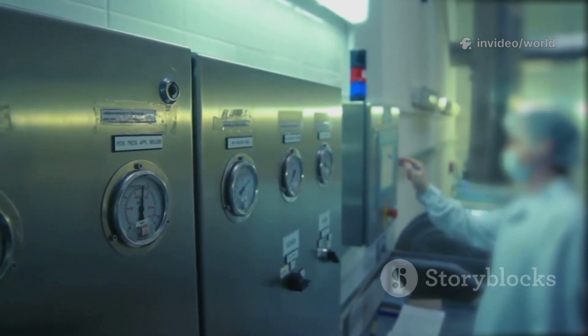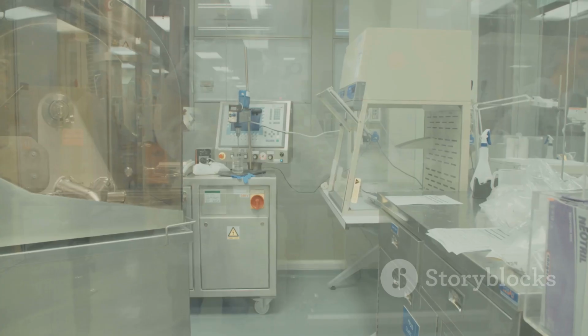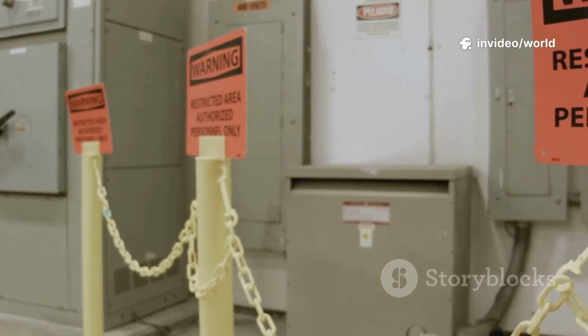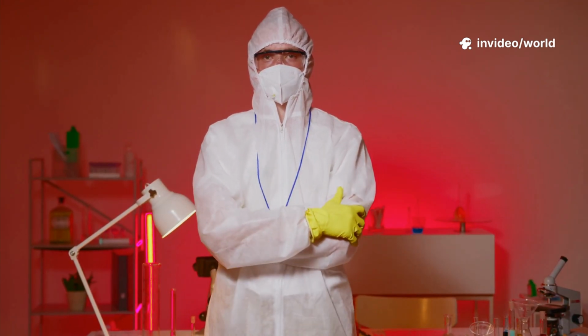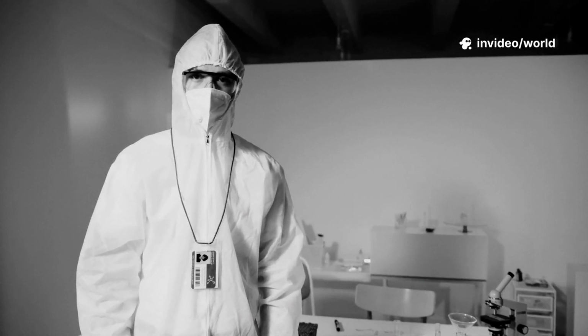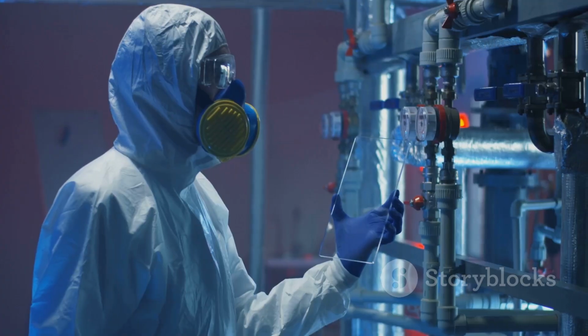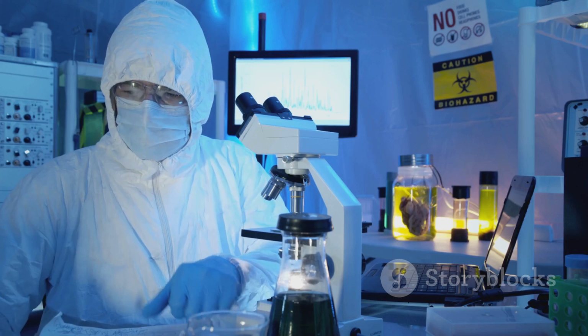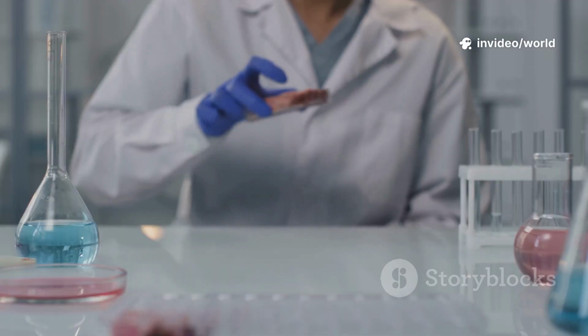We're talking negative pressure to keep the bugs in, HEPA filters to scrub the air, and access so tight you need clearance just to step inside. And PPE? It's non-negotiable. I suit up with an N95 mask or a PAPR, a Tyvek suit, and double gloves every single time. All my work happens inside a Class 2 biosafety cabinet. That's my first and last line of defense against aerosols. Let's break down the steps.